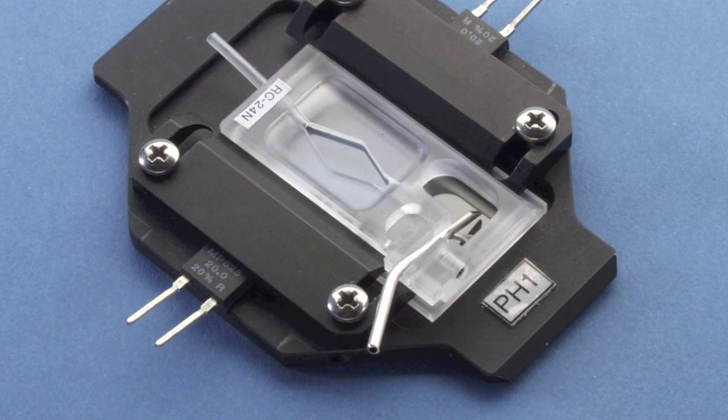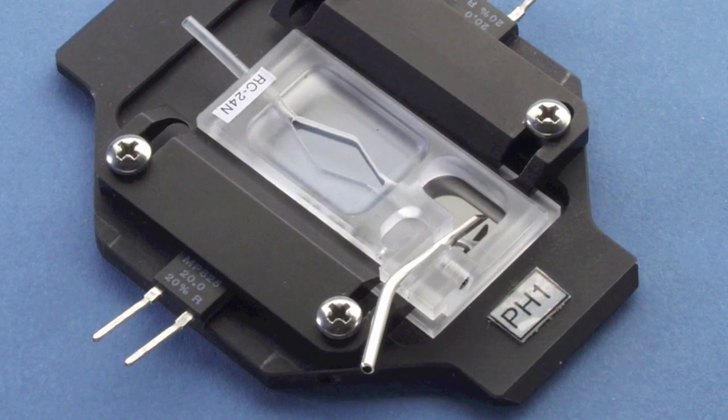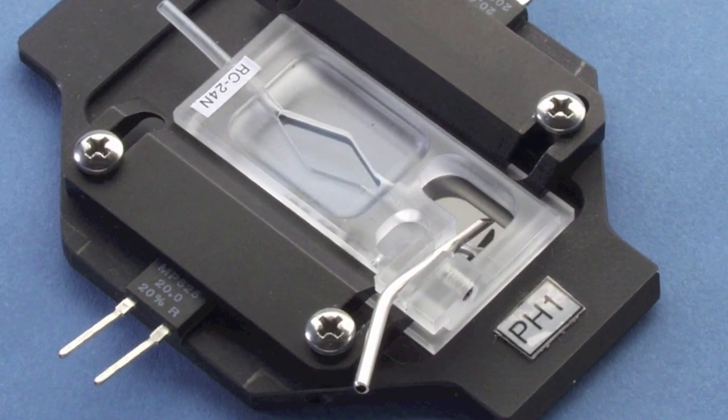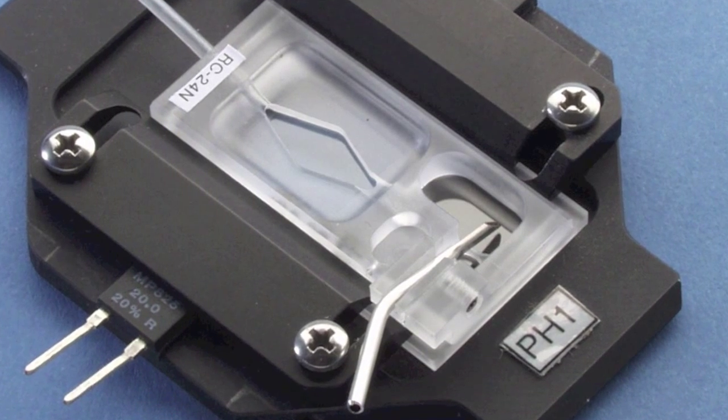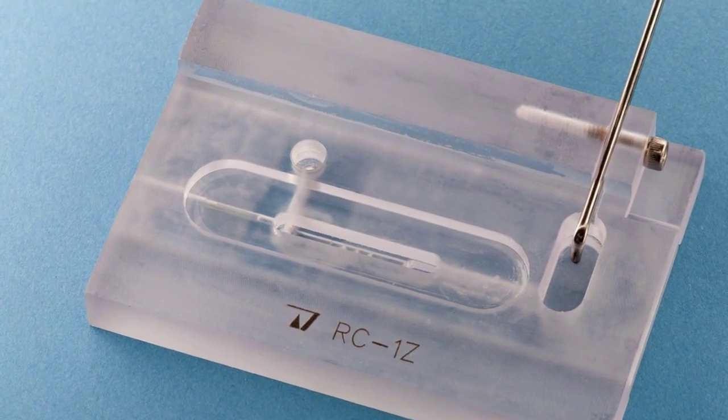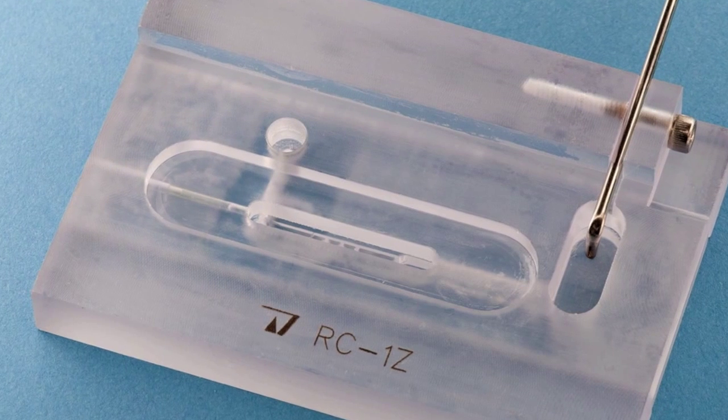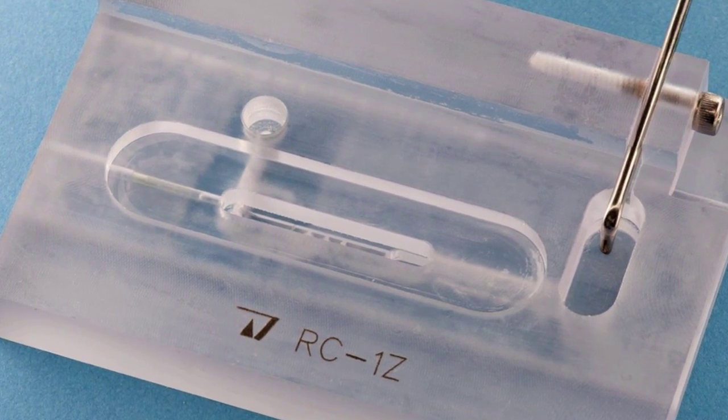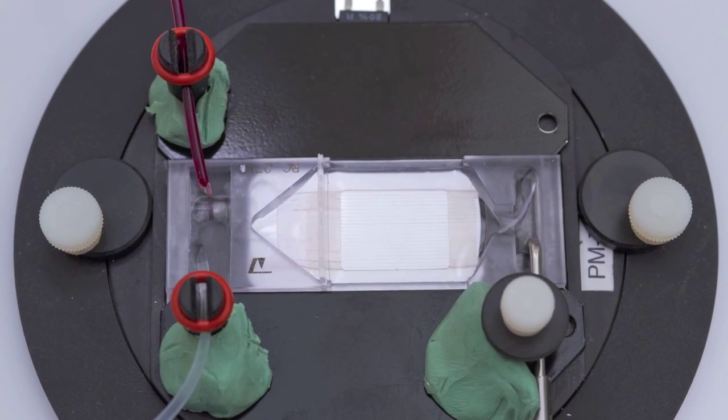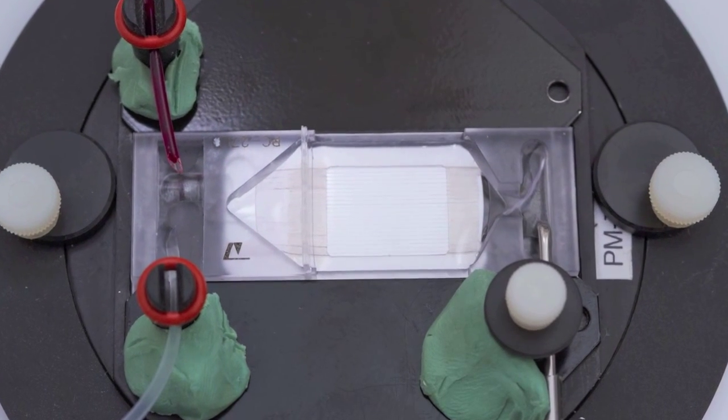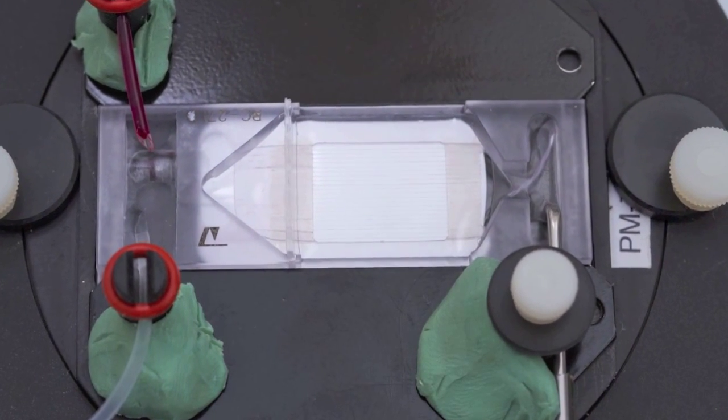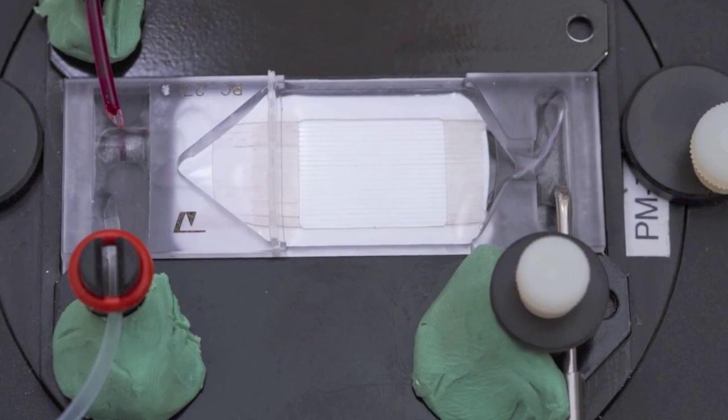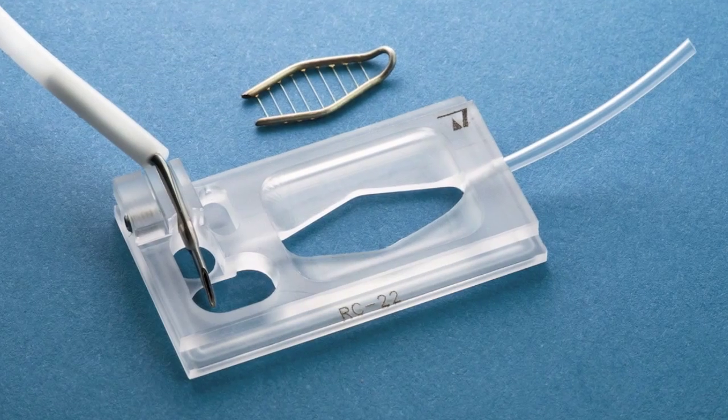Typically, flow rates for temperature-controlled perfusion chamber systems range from less than 1 mL per minute for applications perfusing culture media, up to 10 mL per minute for applications perfusing buffers over ex vivo tissue preparations in relatively large volume baths. Both preparation types are used for imaging and electrophysiological studies.